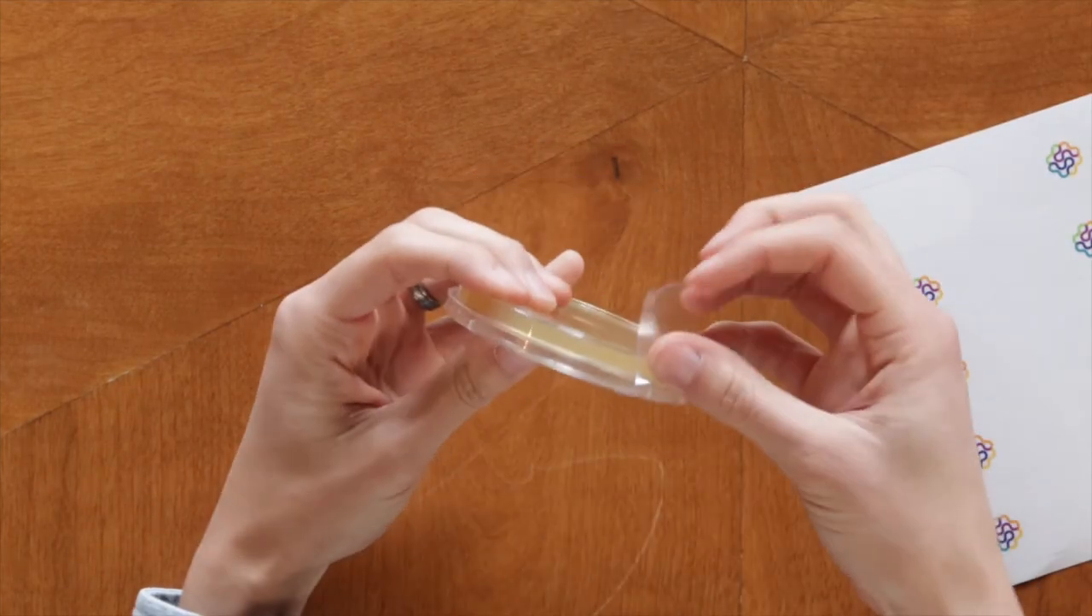Step 3. Sealing and labeling samples. After the sampling is complete, go to your first plate and close it, adding two Immunolytics logo stickers per plate to ensure a good seal. Then, using the enclosed permanent marker, create a label with a unique name, date and time of sampling, placing the label on the bottom of each plate. It's very important that the label is on the bottom of each plate, that is, the darker side with the agar. Repeat this sealing and labeling process immediately after closing each plate, as it will help prevent the samples from being confused.